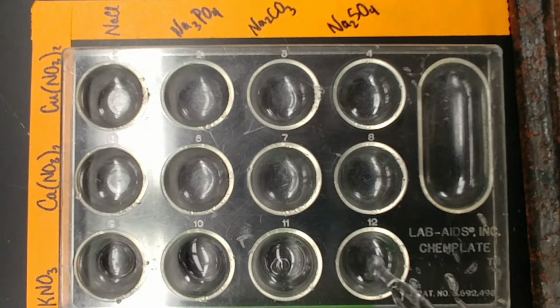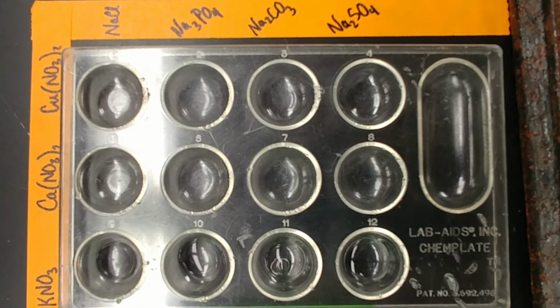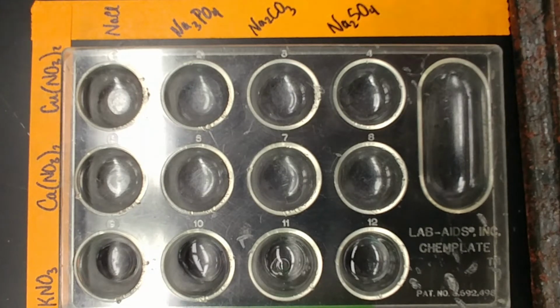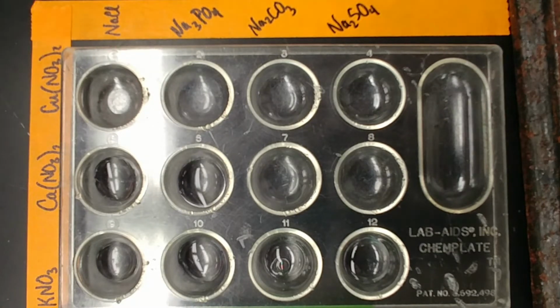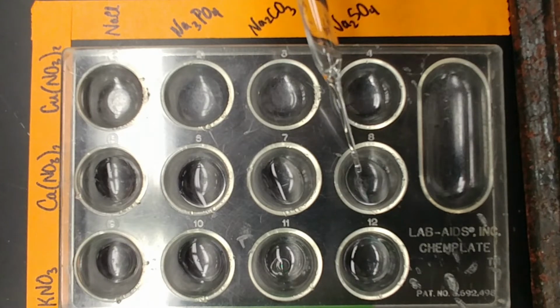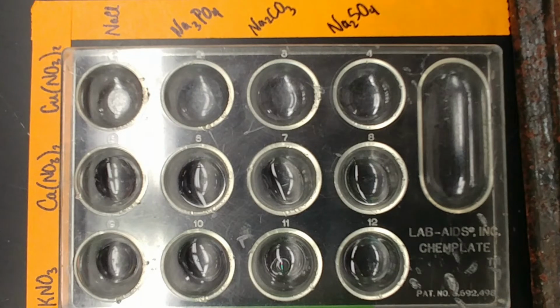Note that when we initially add these solutions, they are just regular solutions. They do not have any sort of solids in them. Next we'll add the calcium nitrate. Again, we're using a little bit more than what you would normally use in the lab because we want to make sure that you can see this pretty easily.